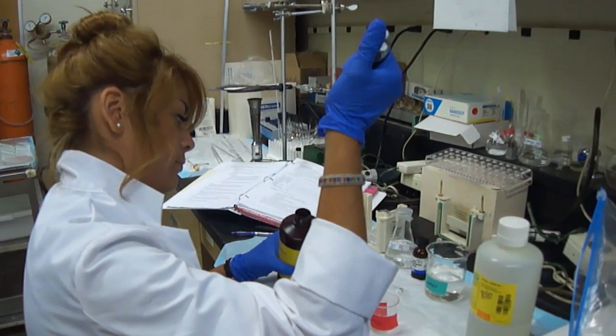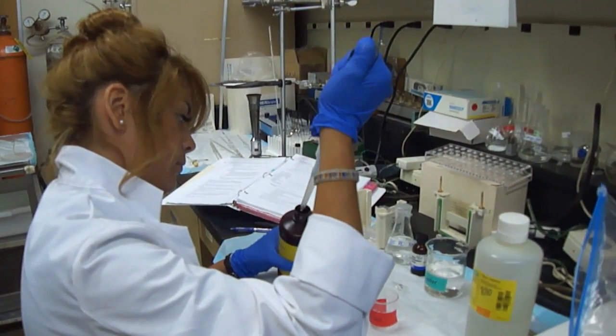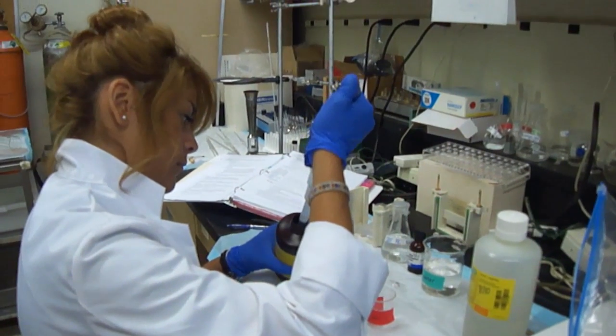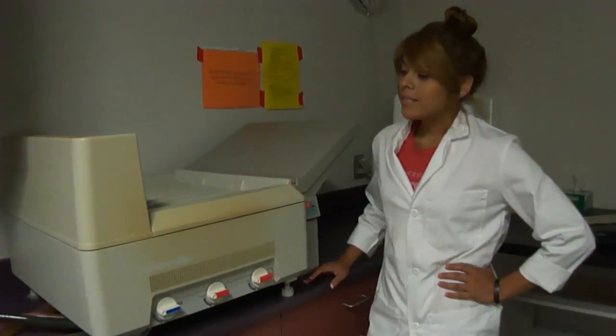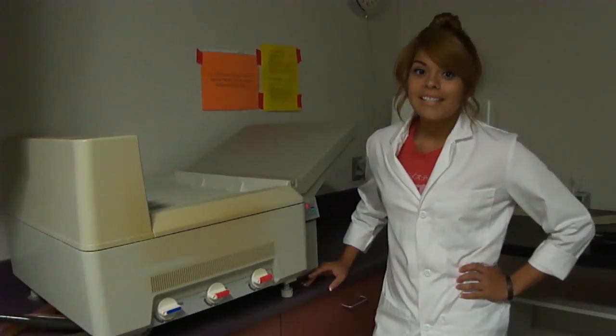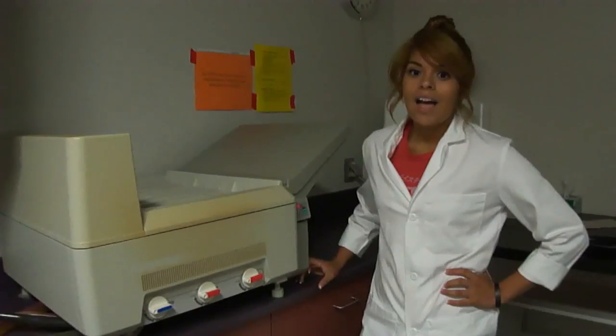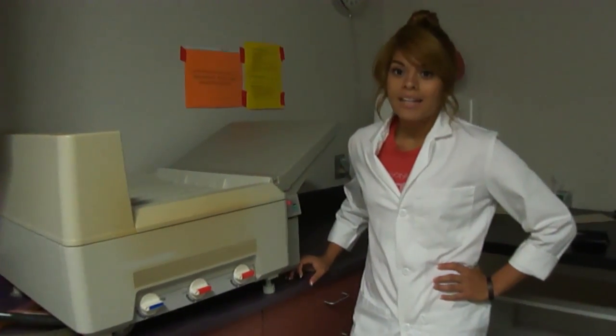We will now transfer the gel onto a PVDF membrane. We will then add blocking buffer, a primary antibody, and a secondary antibody. The secondary antibody emits a signal that can be detected by a special camera. Here in the darkroom, an image will be produced using a special film. The fluorescence given off by the primary and secondary antibodies can be detected on the film, thus allowing us to use the densities of the bands as quantifiers.